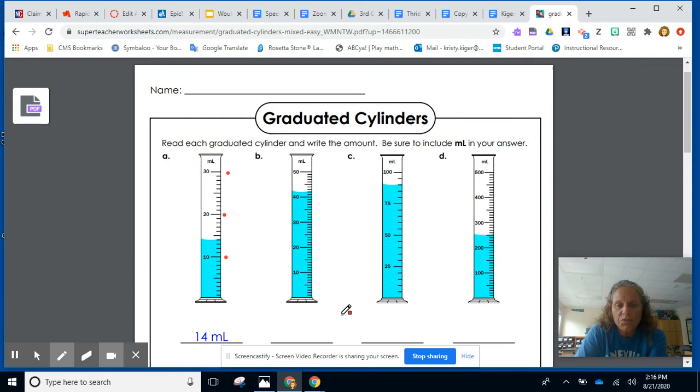I look at this one and I see it's 10, 20, 30, 40. It's counting by tens as well. It looks like it has the same amount of spaces here, it's just probably this one is just a different size. So this one would again be counting by tens. So those little marks, let's just double check. One, two, three, four, five is right in the middle, it's a little bit bigger. So those are counting by ones. So since I know that I just come all the way up here to 40, 41, 42. My writing with this is probably going to be awful. So I apologize. 42 milliliters.